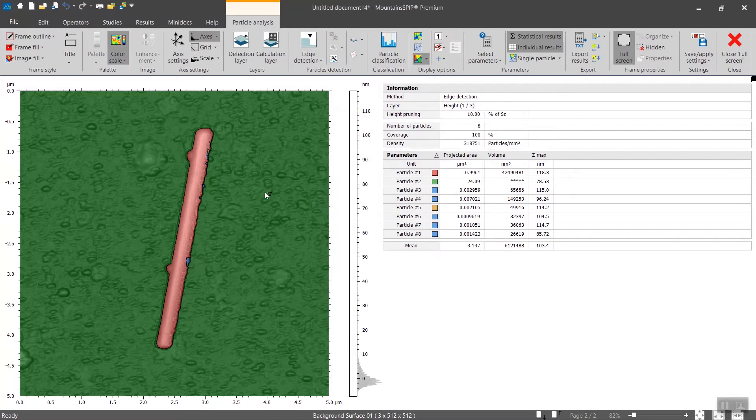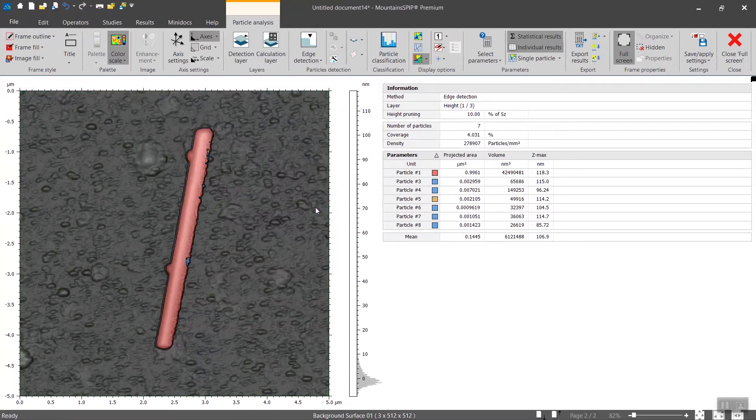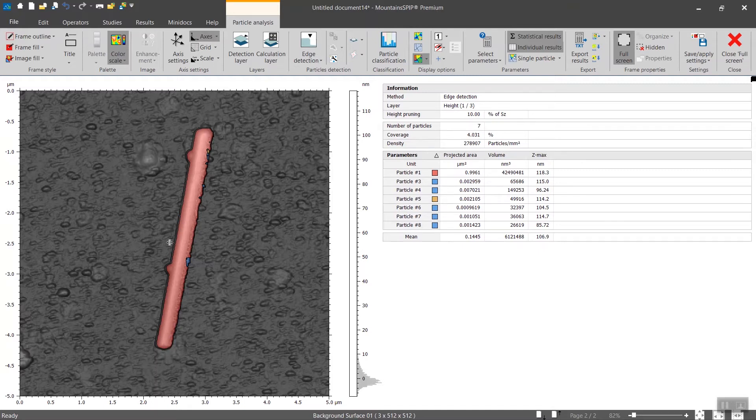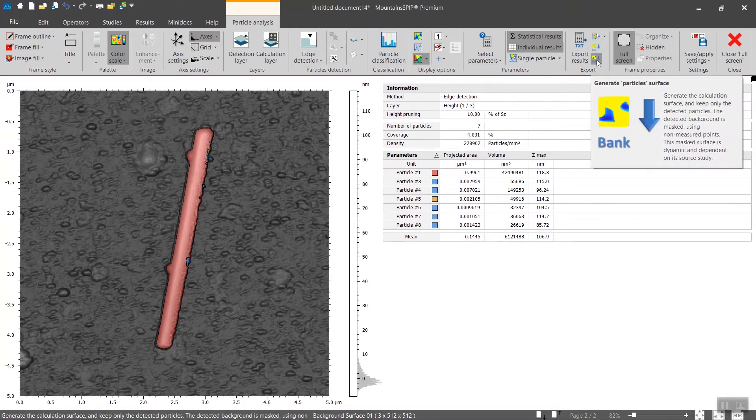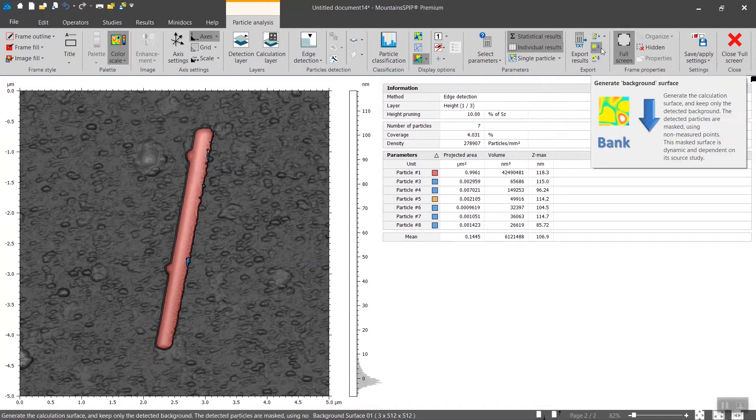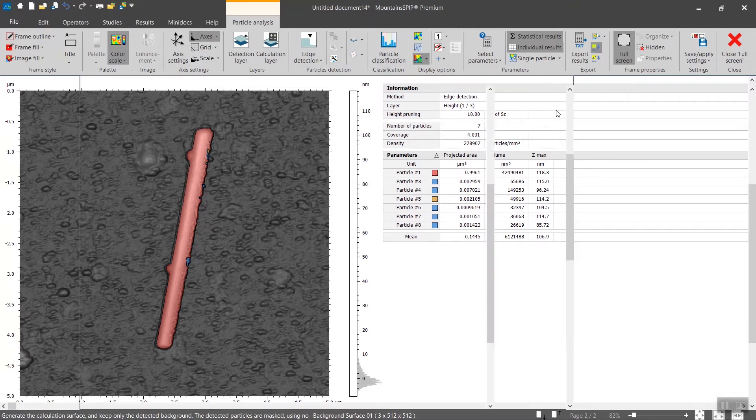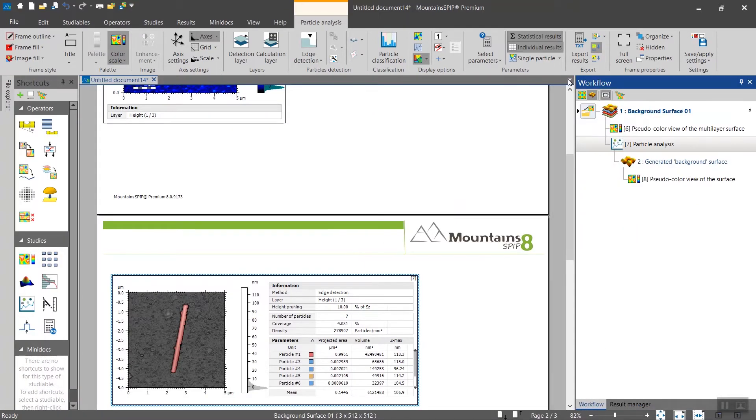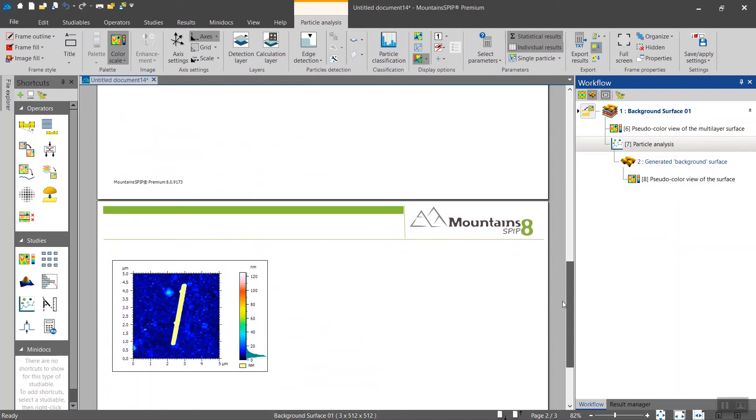You might want to erase the background like that. So we want to remove the tube but keep the background, and to do so there are a couple of export options here. You could generate a particle surface, but what we want in this case is generate a background surface. You click here and in the workflow you have the background surface being generated, and you will find it right here.